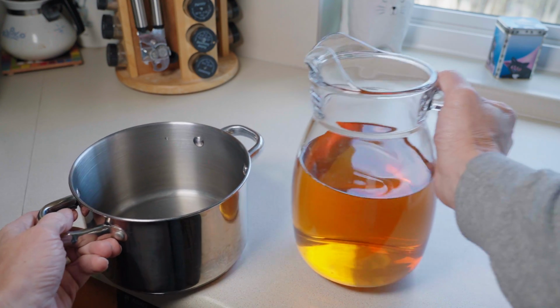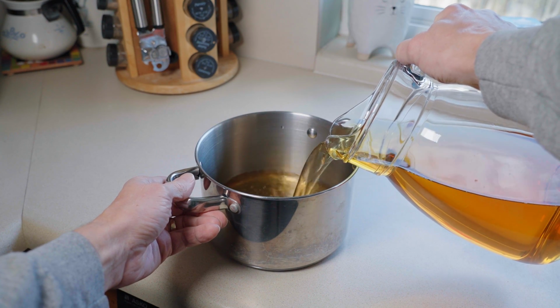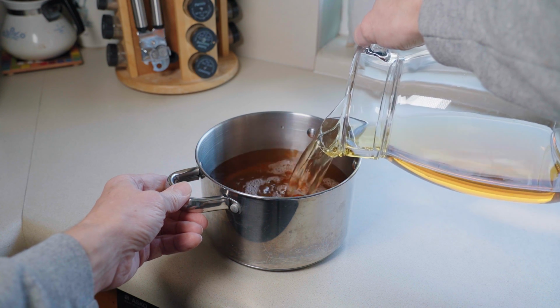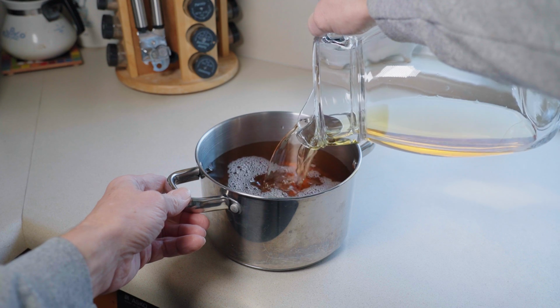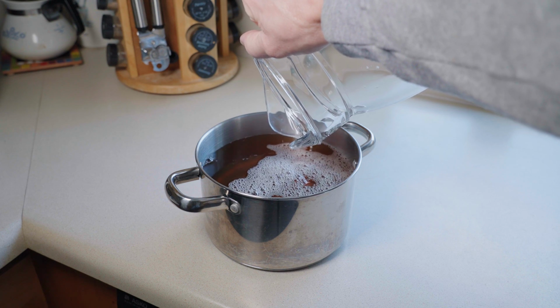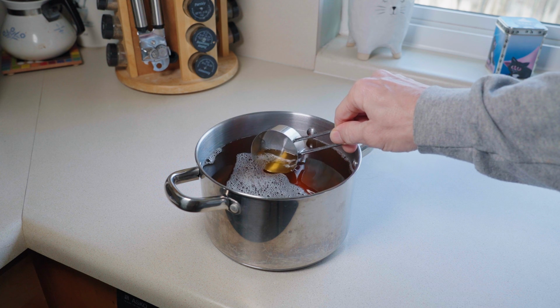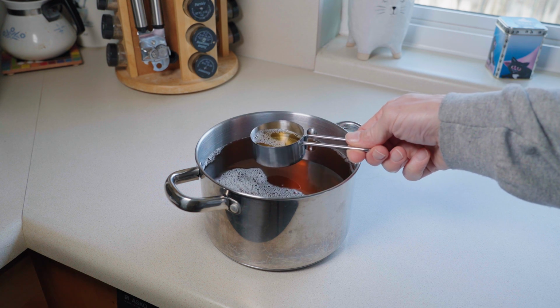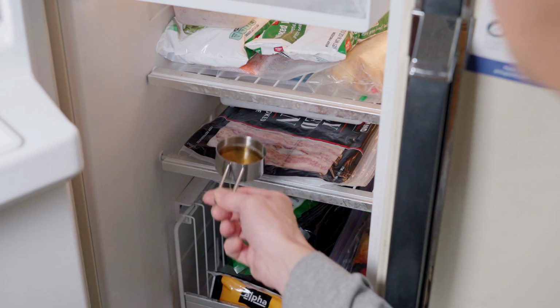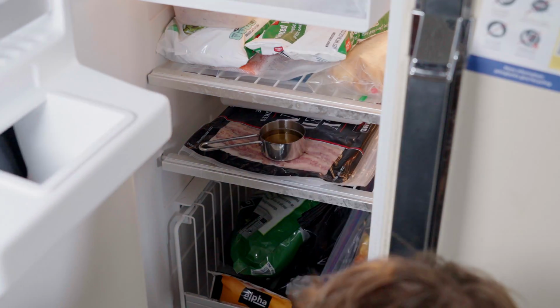Okay, so we have 2 quarts of wort here. This comes from a canned starter wort that I brewed to a little higher gravity than I dilute when I use it. So we're going to pour all this into a pot, which we're going to use to heat it up to the different temperature levels. Before I start the heating, I'm going to grab a little bit and put it in the freezer to cool down the last sample, which would be below normal room temperature. And there, you can see it, we have it on the bacon. It's very important to put it on the bacon.